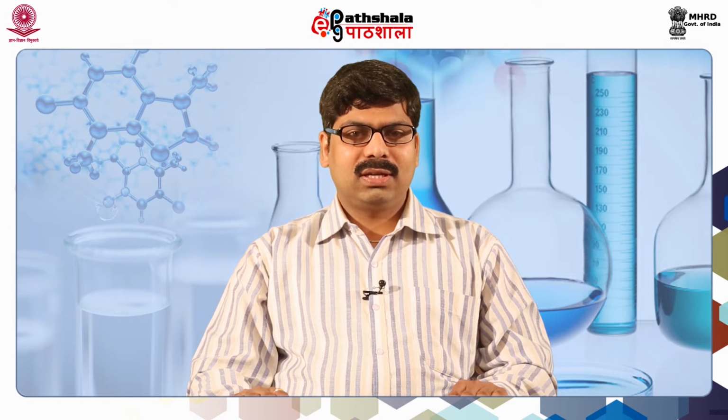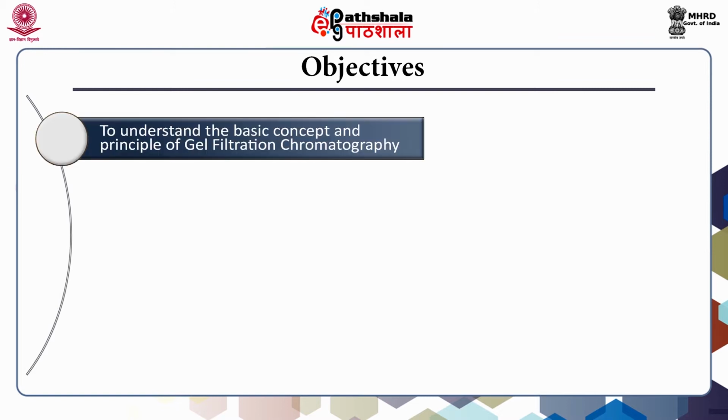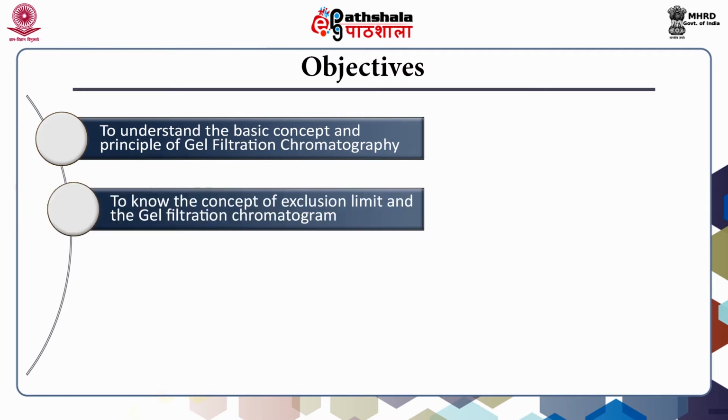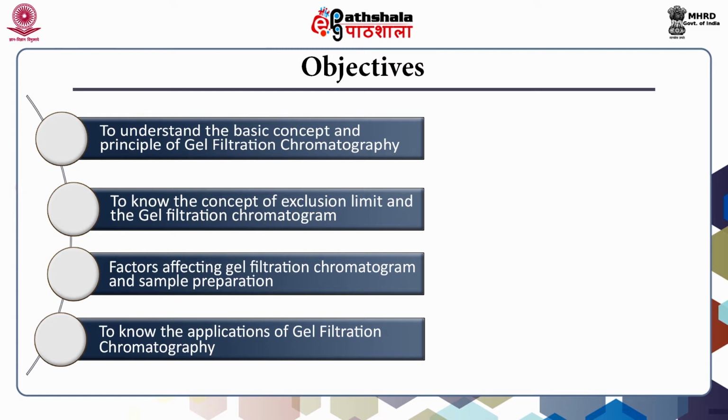Today, I am going to teach you about gel filtration chromatography under the paper Biochemistry. The main objectives of this lecture are to understand the basic concept and principle of gel filtration chromatography, to know the concept of exclusion limit and the gel filtration chromatogram, and to understand the factors affecting the gel filtration chromatogram, sample preparation, and finally, we have to know the applications of gel filtration chromatography.